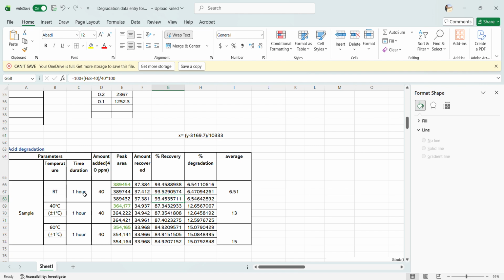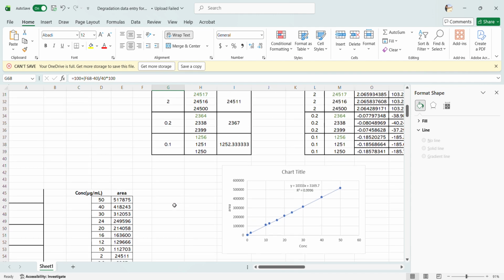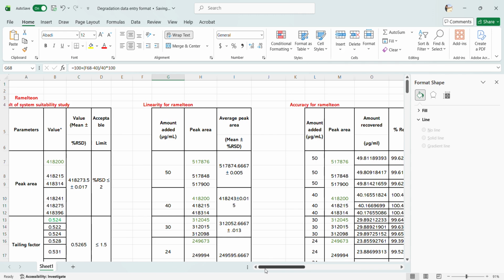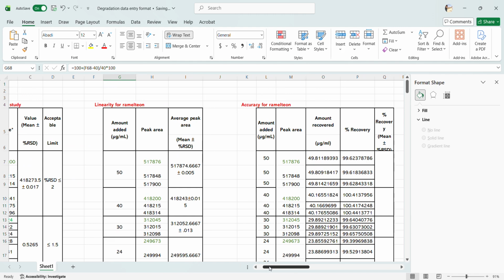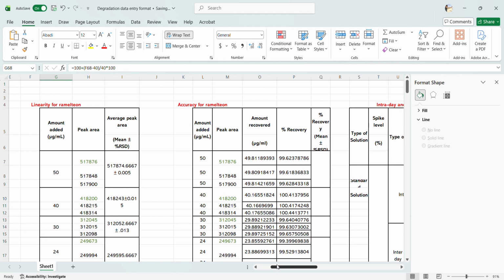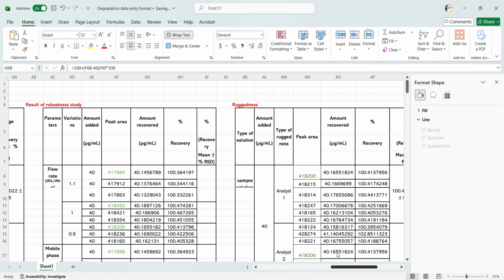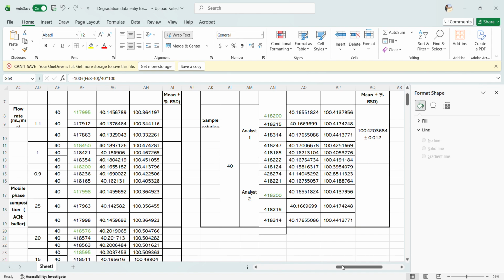We can also do our overall degradation like base degradation, hydrolytic degradation in the same method. HPLC will provide you the peak area. You'll just put the value in the table and ultimately get the result. So this is the overall approach for the validation and degradation using the HPLC method. The International Conference on Harmonization, that is ICH, put the analytical method, and they declared these analytical tests to be performed. That's why we are undergoing these analytical tests using the ICH guidelines.